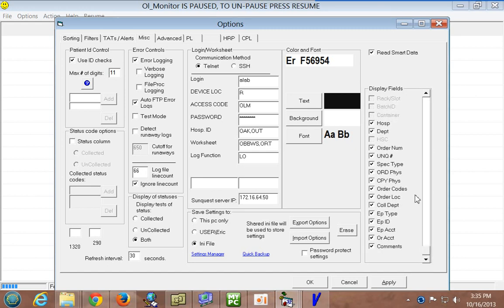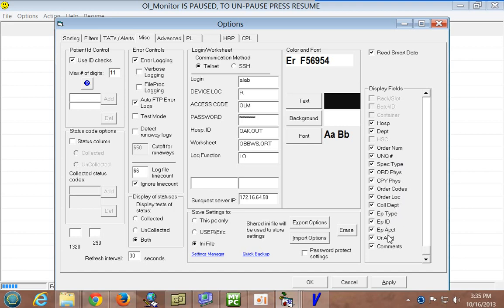And, yeah, HRP has a lot of information. You've got the order number, unique number, whatever that is, specimen type, ordering position, copy position, order codes, order location, collection department, episode type, episode ID, episode account, OR account, and comments. And, from all the examples that I've seen, not all of these are populated, but your mileage may vary, you know, maybe your site uses that stuff. But, yeah, you can check them all, and you can see them all if you want to.